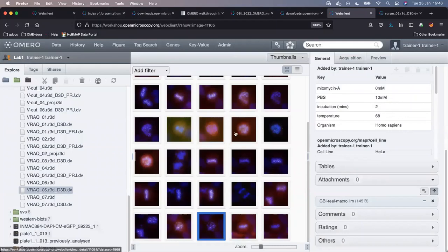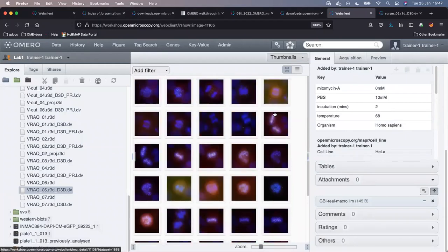Very good. So this leaves me with some time to start on this would be the annotations, which we just went through, a very important part. And now let's go mentally further in the workflow of a typical scientist. I have imported the images. I made some general first overview of them. I viewed them. I drew manually some regions of interest, done some rudimentary analysis, a pilot analysis. Then I want to seriously analyze them using some more powerful analysis software such as Fiji.